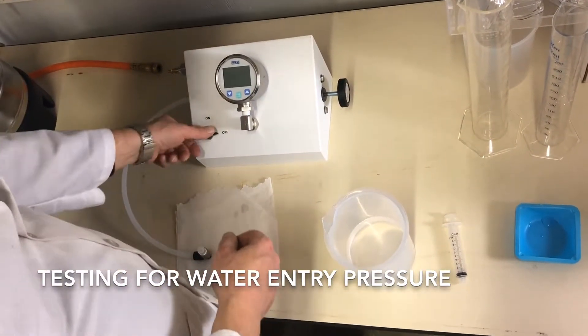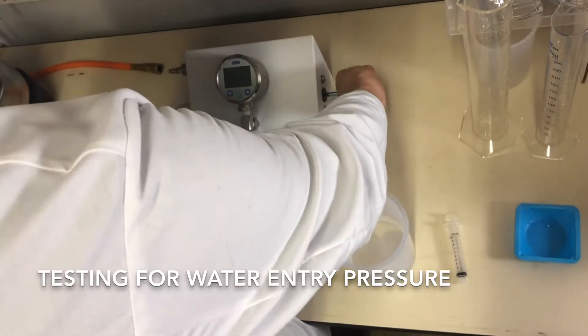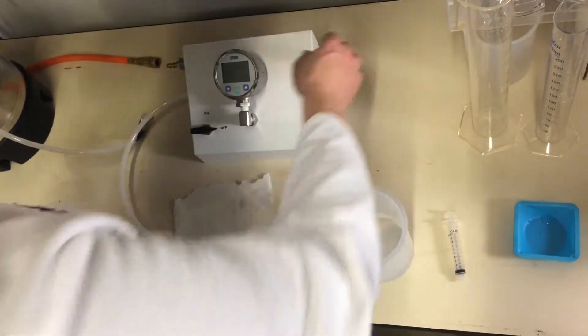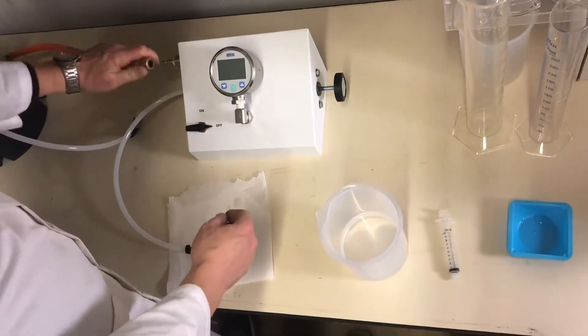We'll verify the valve is off. Make sure the knob is screwed out counterclockwise efficiently. We'll attach the airline.